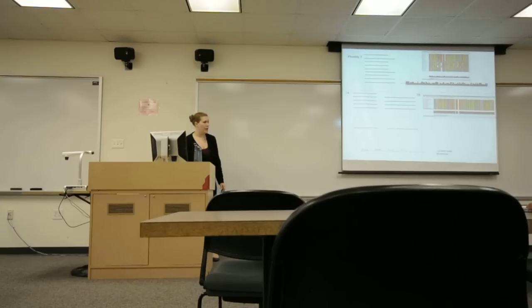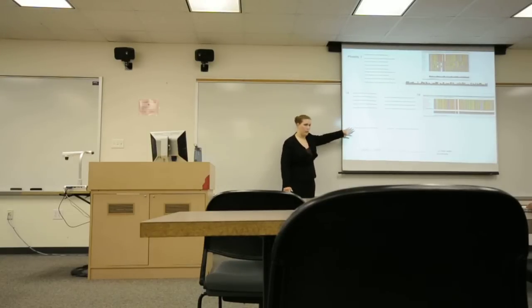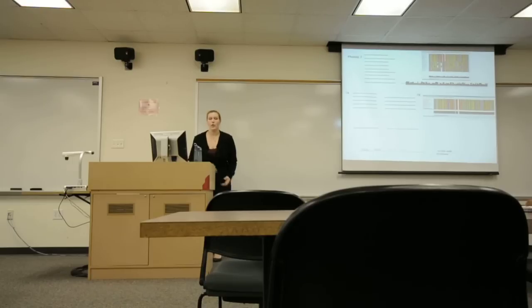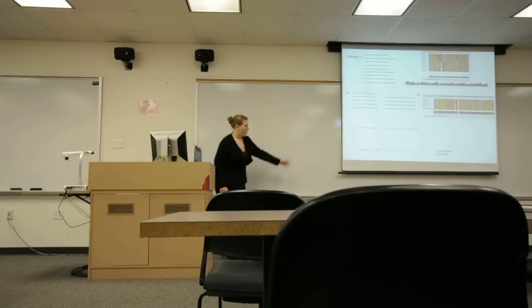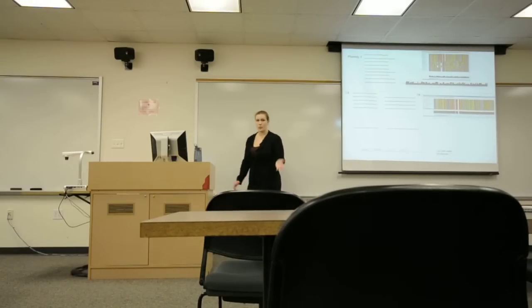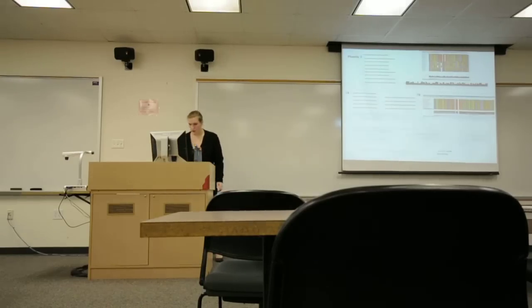And basically, the consensus sequence represents this entire black line, and we would enter that consensus sequence into a program called Picky, which is also freely available online, which chooses an appropriate probe based on your inputs. And so an example would be this little chunk of purple would be the probe, and the little chunk of gold would be the probe. And those would be the spots put on the slide. So there would be 10,000 of those little guys.